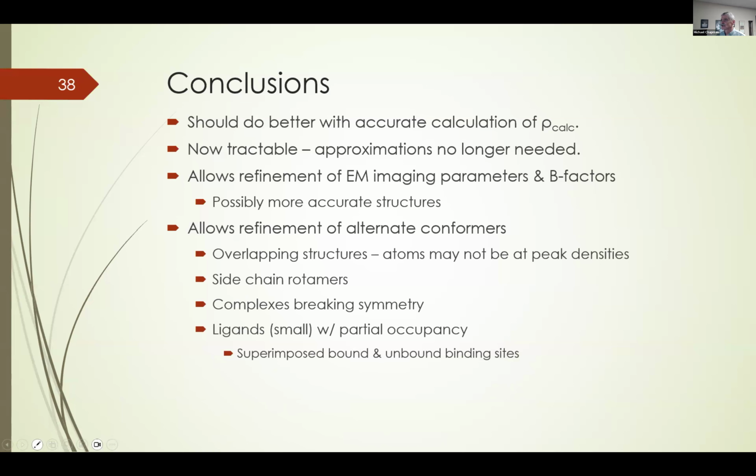In many cases, the parts of these structures that are different are too small to allow easy focused reconstructions. And so we think it better if you can be refining with methods that allow the components and neighboring atoms to be included.